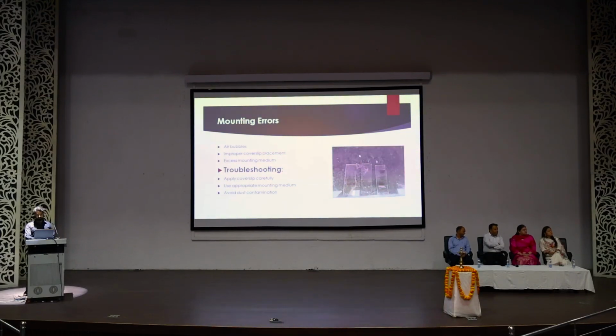You can see the cover slip is slipping towards the right, and here also, and it's not the right way. Solutions for these common errors are: keep the stained slide in xylene and apply the cover slip properly. Use appropriate mounting medium and avoid dust contamination and excessive mounting medium.